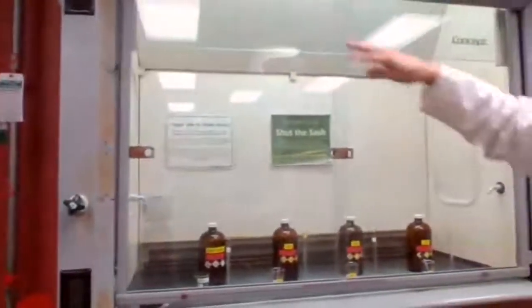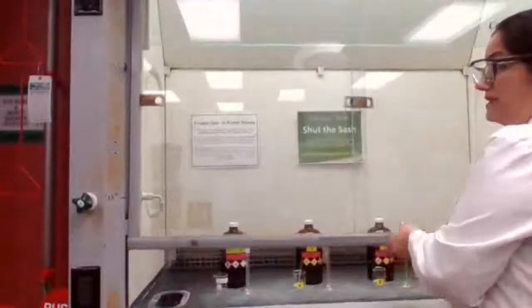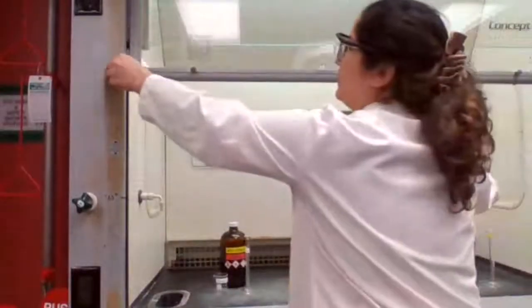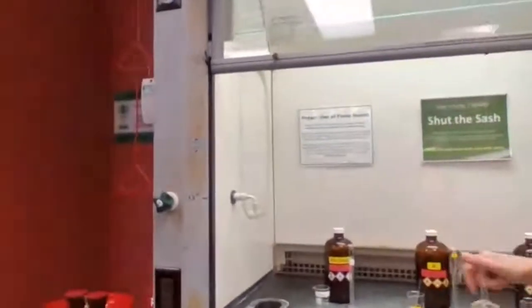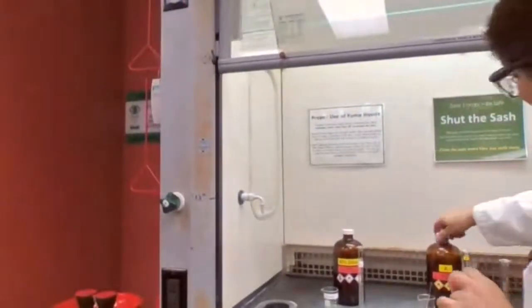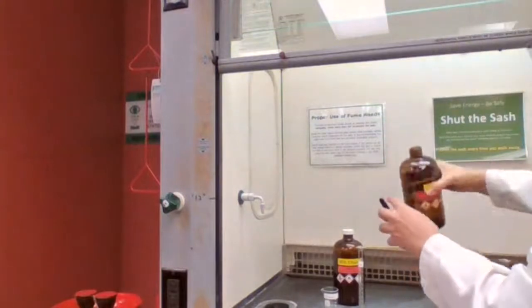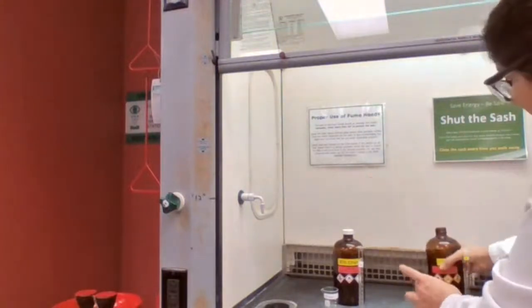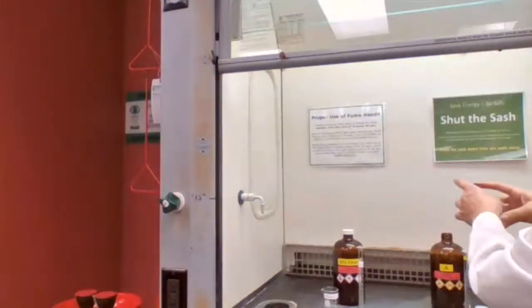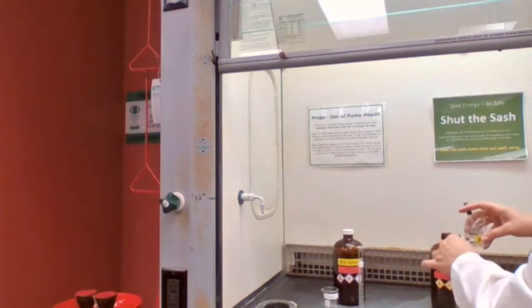And why fume hood? This is the fume hood. It's a small room. The fan is on. Any vapor of this chemical is going to be pulled up, filtered, and clean air would come back to the room. Especially chemicals that have a low boiling point, or are volatile or organic compounds, it's not safe to keep outside. We have to place them inside the fume hood.